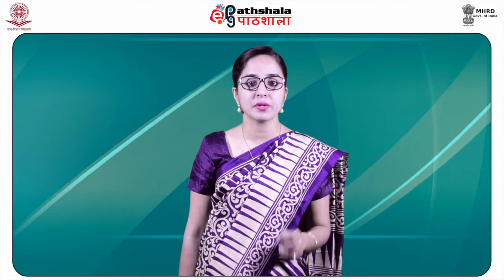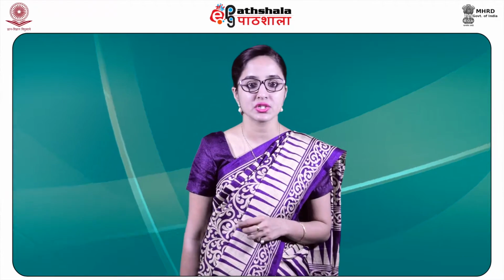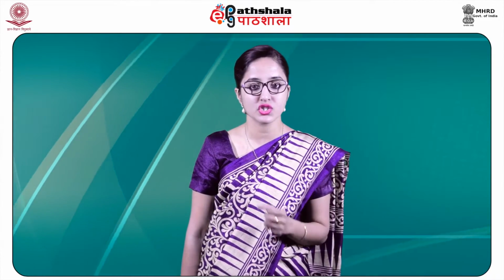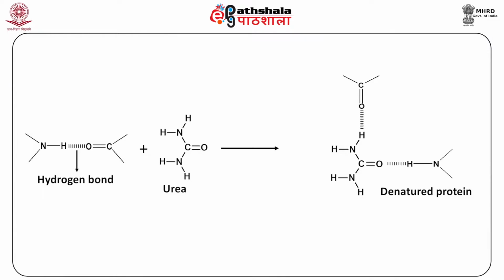Oligonucleotide samples are prepared in formamide and 1x TBE. The sample solutions are heat treated at 95 degrees Celsius for 5 minutes and then immediately transferred to the icebox. The gel is run at a high voltage of 180 to 200 volts in the buffer containing 1x TBE. After electrophoresis, the gels are stained with ethidium bromide or Stains-all, and bands can be visualized under UV visible light. Now here in this figure, you can see that urea disrupts the hydrogen bonding between the functional groups and proteins, and we have shown this clearly in this figure.